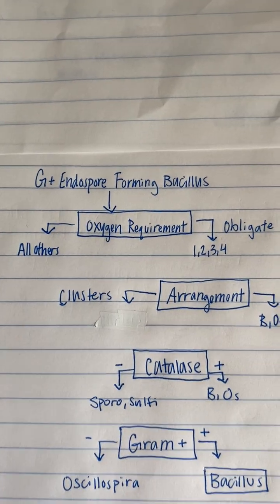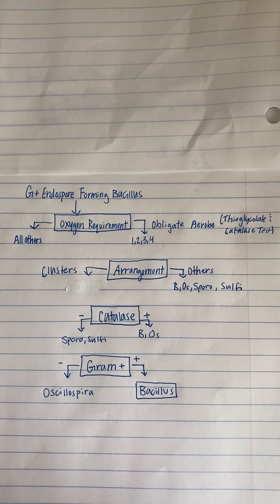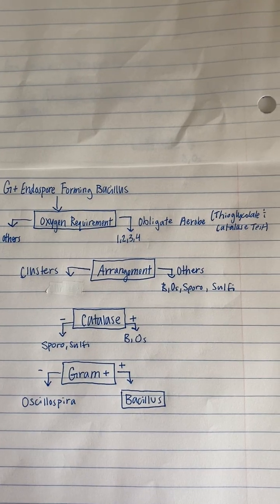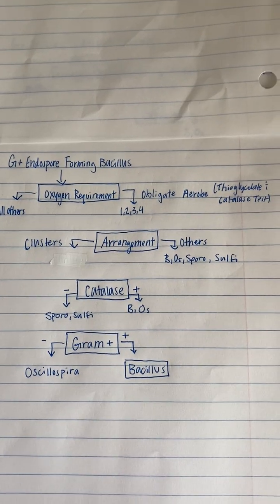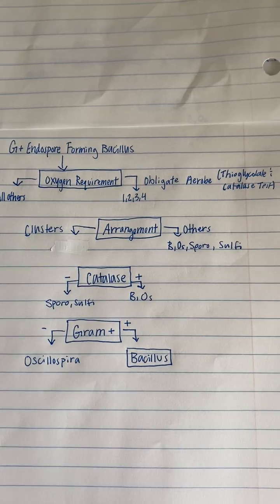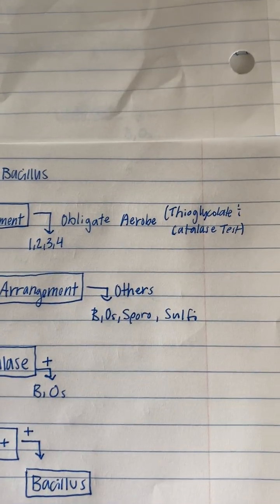For the oxygen requirement, my result is that the isolate is an obligate aerobe, and this is proven through the thioglycolate and catalase test. Both of those were positive. My oxidase and nitrate tests were both negative, which don't really have a meaning, so we're going off these.